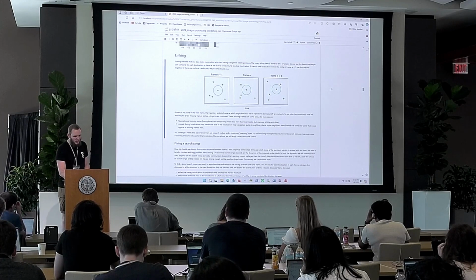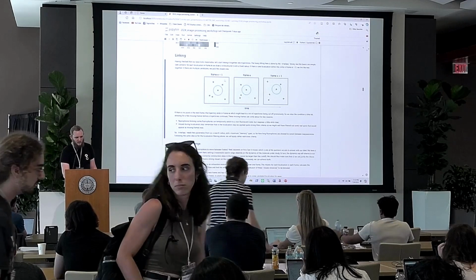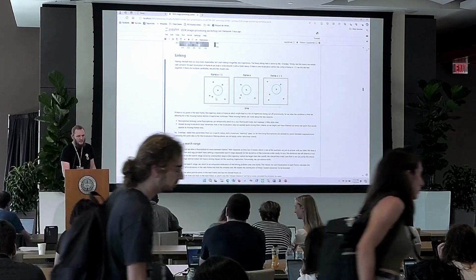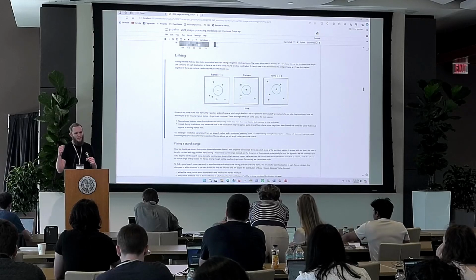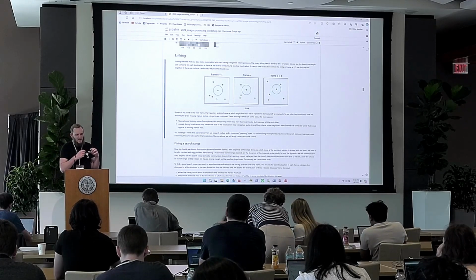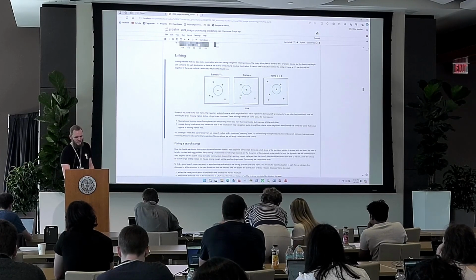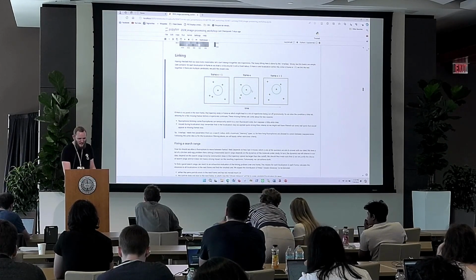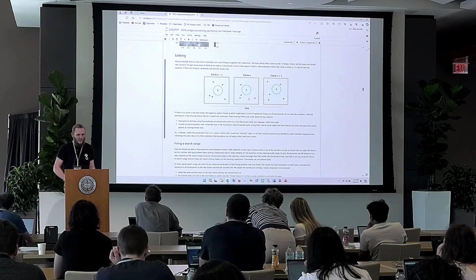So the figure I put up here gives you a little bit of an intuition. You start in some frame of your movie. You have a bunch of localizations. That's these little stars here. And essentially what you do is you draw a circle around it and say everything that's in the next frame within this circle around one of my localizations is a candidate for the same particle in the next frame. That's the figure over here. And if your imaging conditions are very nice and easy, then you will find one particle within this linking distance, and then you can just link them together and be happy.